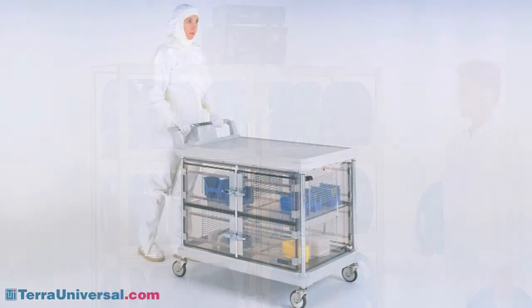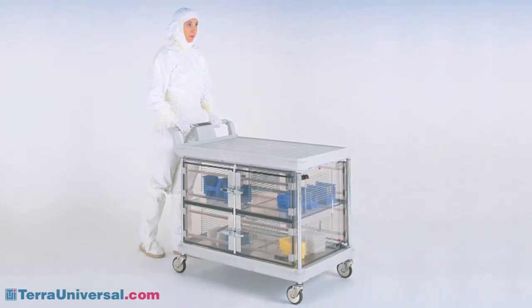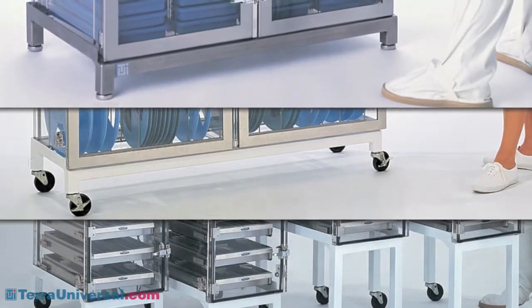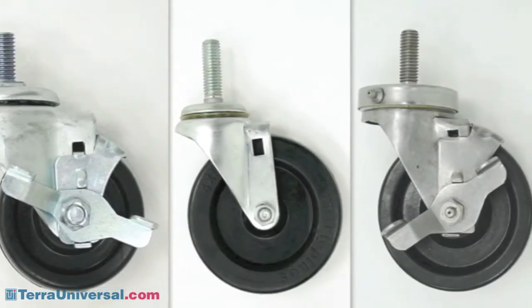Desiccator carts provide dry conditions during parts transfer. Stands are available in powder-coated or stainless steel. Terra offers a number of caster options, including all stainless steel models for the more contamination and corrosion sensitive environments.